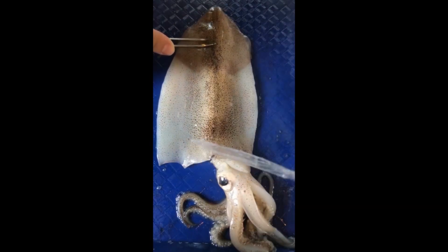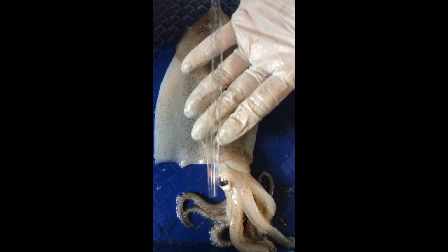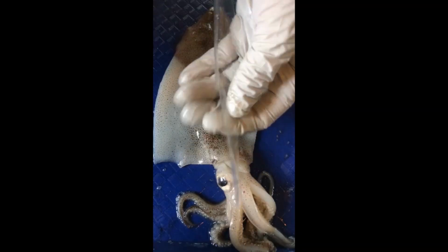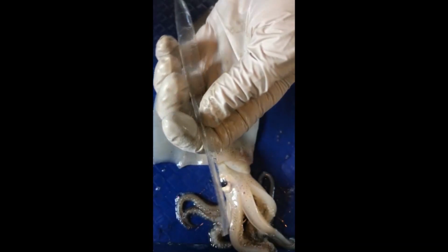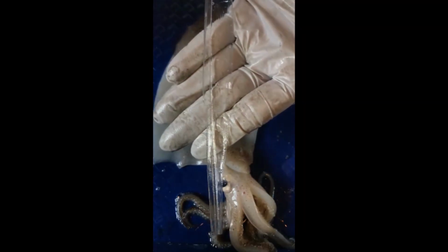If you're ever eating calamari, usually the restaurants always have to take these out. As you can see, the pen is just as long as the mantle, and it gets the name pen because it looks just like an old writing pen. The pen helps hold together the mantle. It also is an indicator that squids actually were shell organisms long ago, and through evolution they ended up losing most of their shells, and this is the remnant of it.